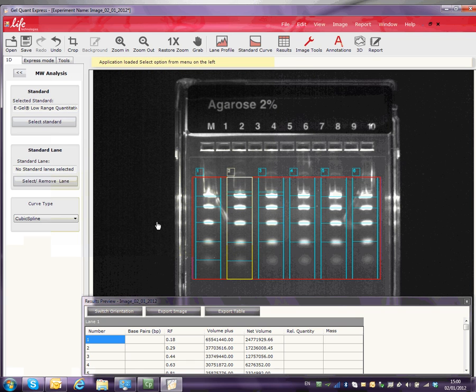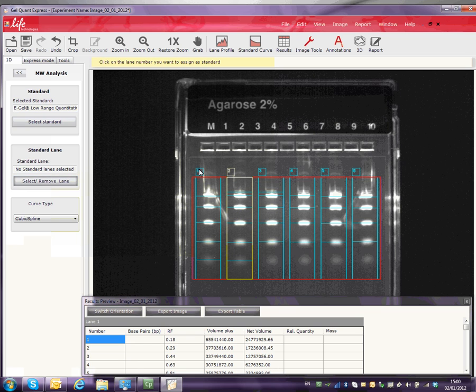Next, click on the Select Remove Lane button and move the cursor to select the lane with your standard. The molecular weights will automatically fill in for all bands.